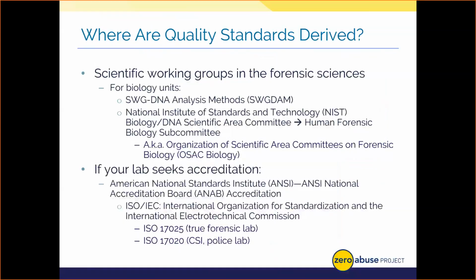All right, now on to this slide, right? I jumped the gun a little bit. So where do we get our quality standards? Well, you can see some of the organizations here. Our standards for what methods to use and best practices entail, including the lab space and the equipment considerations. Those come from federally designated working groups with leaders in the field of forensics. Each forensic unit, in fact, has its own scientific area committee aggregated under the National Institute of Standards and Technology's Organization of Scientific Area Committees, or OSAC. Now, not included under OSAC, when we're talking about DNA and biological units, is the previously mentioned SWGDAM group.